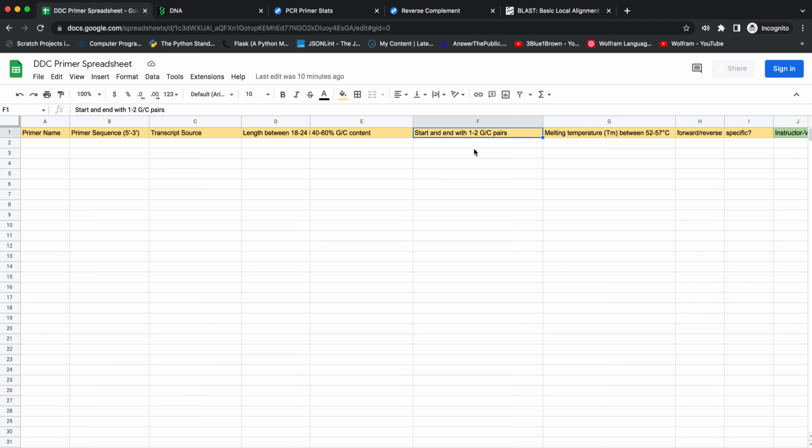And so you want to make sure that the primer binds strongly near the end of that sequence, because that's right where the polymerase is going to start acting. And so it's very important that you have a tight interaction there. So perhaps this GG here would be a good place to put a primer.